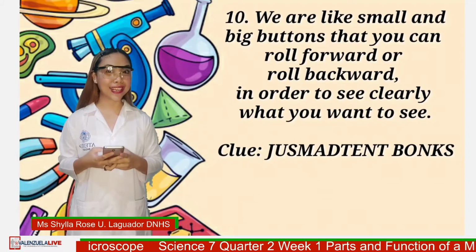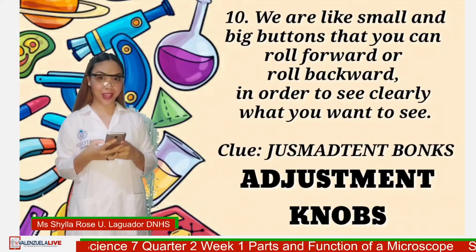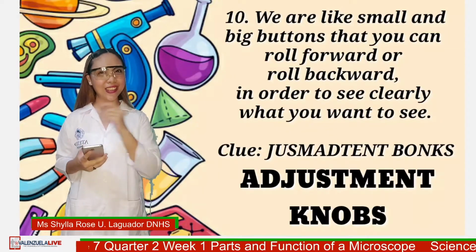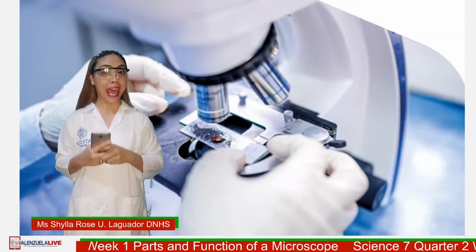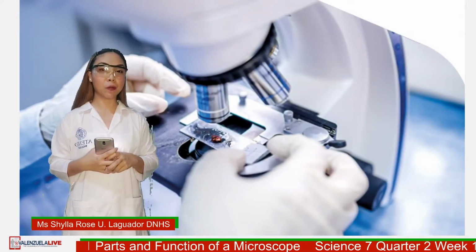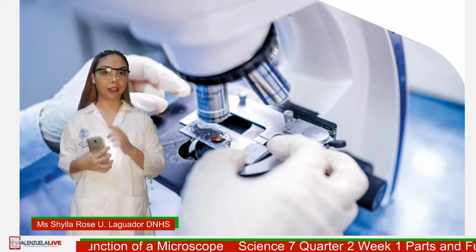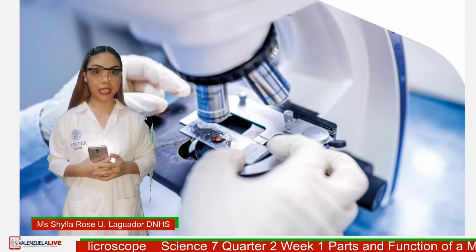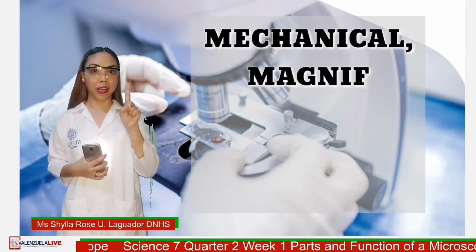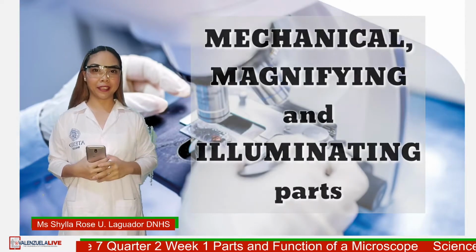Okay, so the correct answer is adjustment knob or adjustment knobs. Great job, grade 7 students. Thank you for your responses. Actually, the parts of a microscope can be easily known if we classify them according to their respective functions. We can group them into 3 different categories, namely mechanical parts, magnifying parts, and illuminating parts.